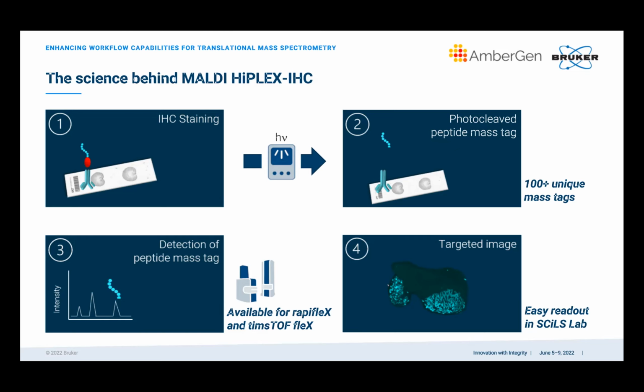Yeah. So how about based on the single cell? So can you grow the cell? Yeah. You can grow cells on a MALDI imaging slide, and we can provide some guidance there as well. You could also take something like the cellenONE, and you could spot down single cells, and then you know exactly where they are. So then you know where to image when you go back and want to look at that. So absolutely, it's another great marriage of that single cell theme with MALDI imaging.